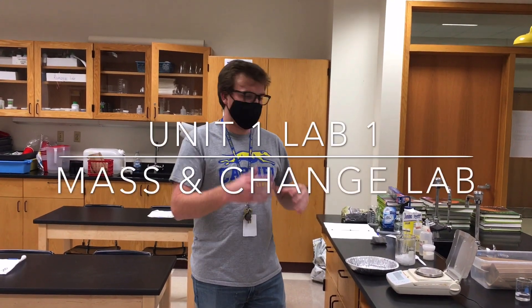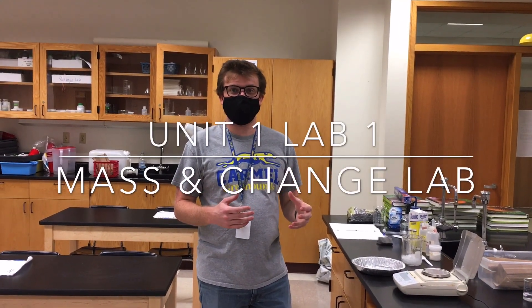Hey everybody, Mr. Sharkey here. Mrs. Cat and I are going to walk you guys through this first lab.